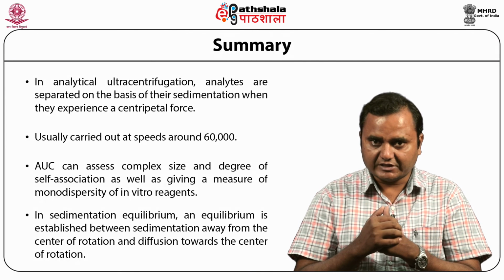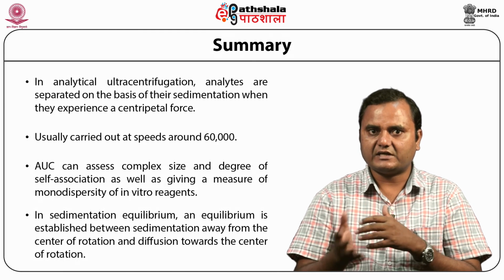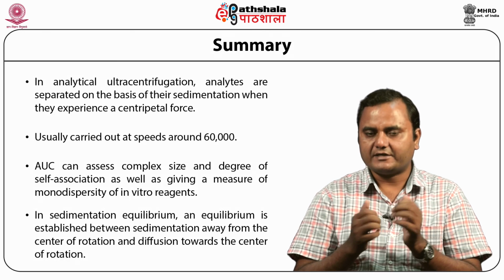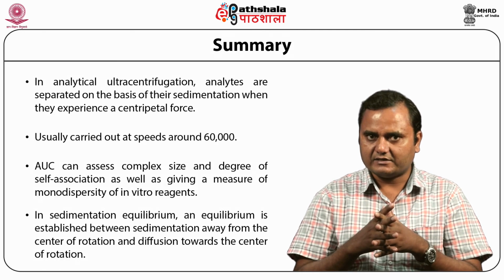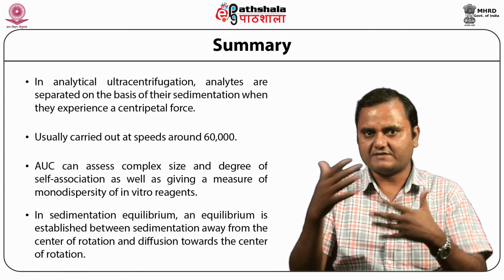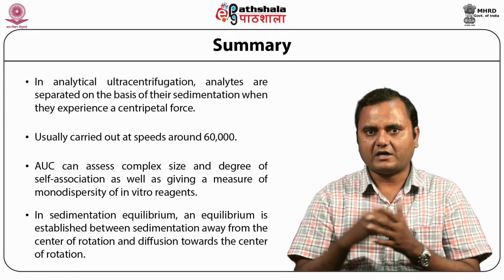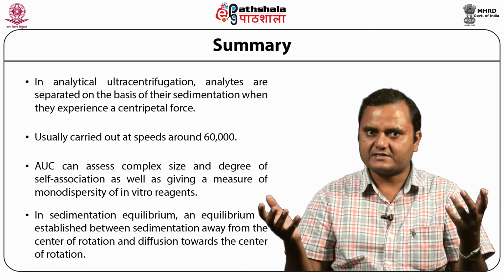Sedimentation equilibrium is an equilibrium established between the sedimentation away from the center of rotation and the diffusion towards the center of rotation. So this is all about the analytical ultracentrifuge. I think now you are much more aware of this. You have already seen all the details: the structure, the components, how it operates, everything.